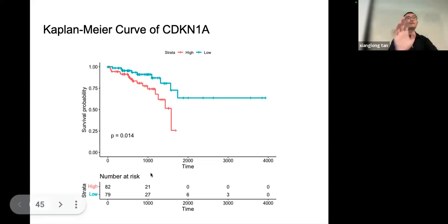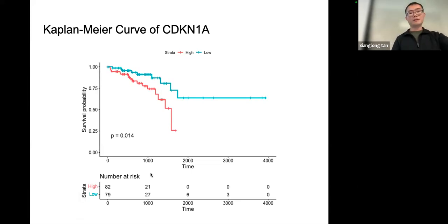And those are the parameters for that risk table plot. So this is just a simple expression that we can differentiate by a single gene's expression level. And in the future, you can merge this with your DNA methylation data sets or other things you want to, and create your individual survival plot of your interests.